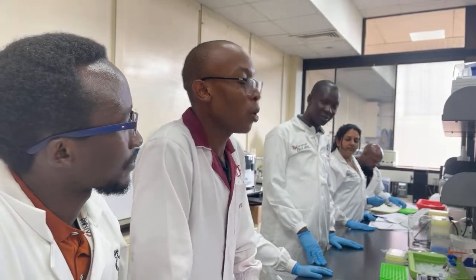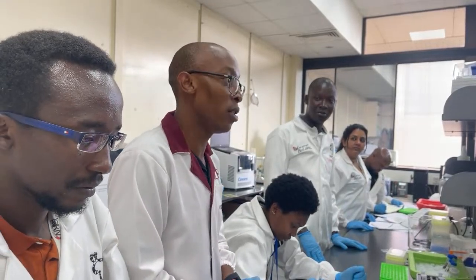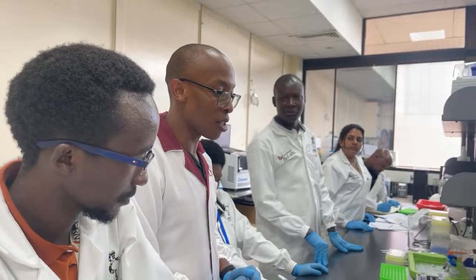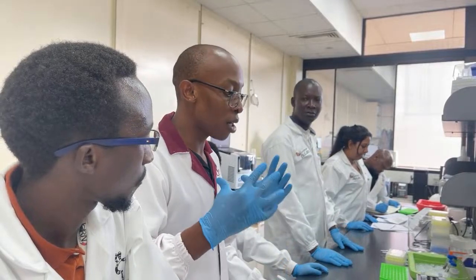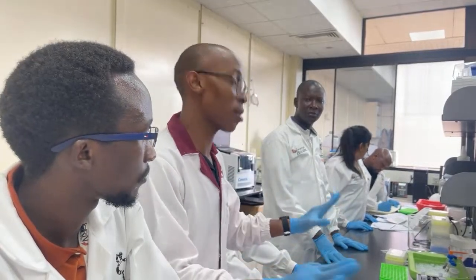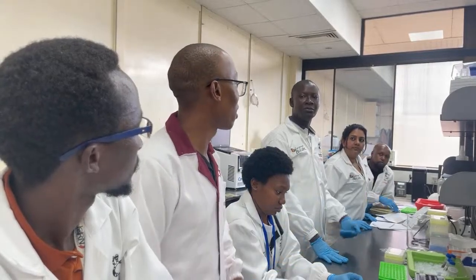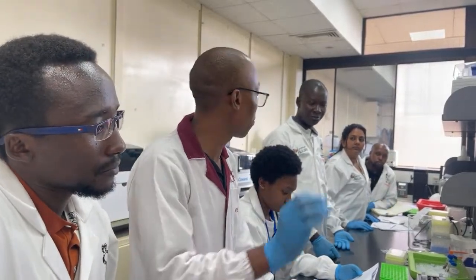Where do you fit in the fungi? The fungi, you see, fungi is difficult. It's one of the difficult organisms to extract. It is really, really difficult. For us, we've tried different kits. It depends on the type of fungi, how complex it is. But we found that with Zymo Research, there's a kit called fungal bacteria that we use. It just works perfectly for us. That's what we use. We never use fungal for these ones. And I think even Pepper will tell you that, look, it's difficult with this. There's nothing specific for fungi. So we'll go with the Zymo fungal bacteria kit. It works perfectly for us.